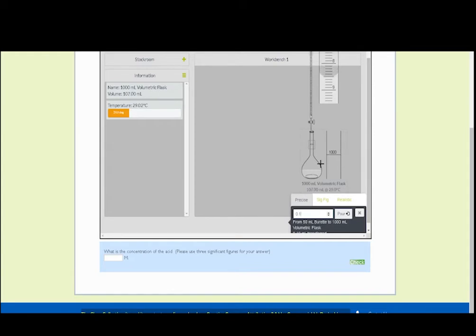So we're getting to the point where we could start to see something happen, so I'm going to be going a little bit slowly. And if you overshoot by 1, and you know that you overshot by 1 or by 2, you can always just subtract that, because it's only 0.1 every click. So you're going to be able to find that pretty easily if you went over.